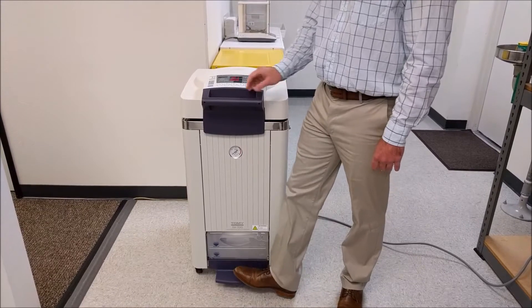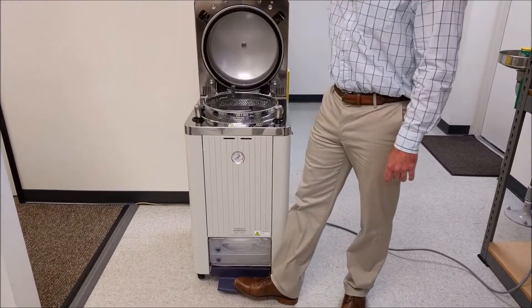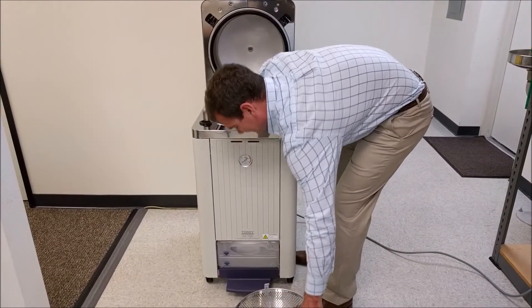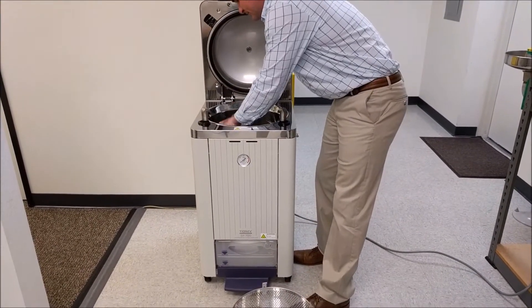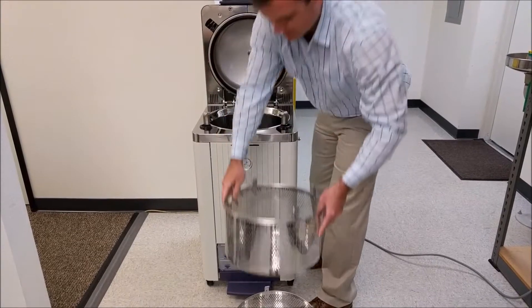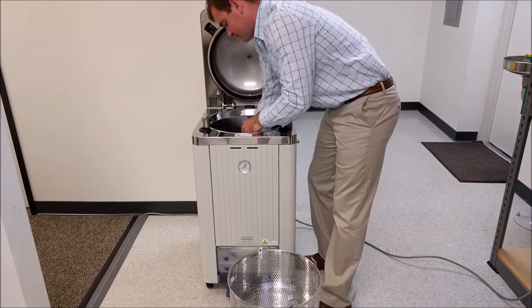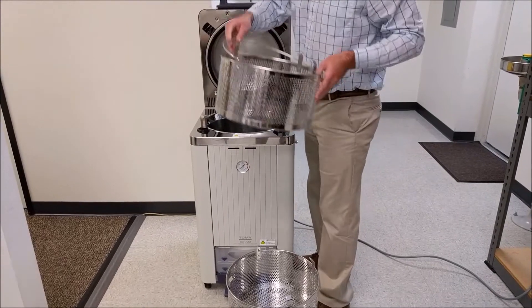This model can accept about three baskets: one, there's two, here's three.